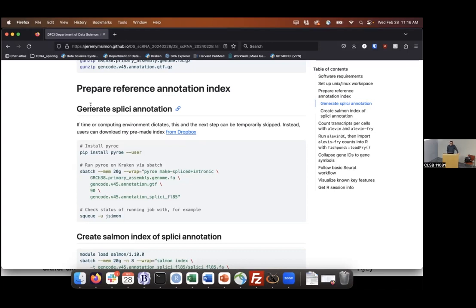Yeah, there is some math that is a little bit counterintuitive about at what point you have sequenced so many cells from the same sample that you are no longer necessarily getting the same cell with two events that have the same cell barcode. They're actually two cells that just by random chance have the same cell barcode sequence. That does happen.